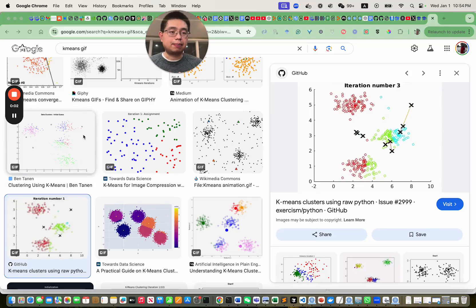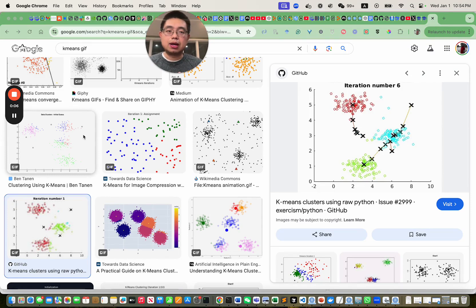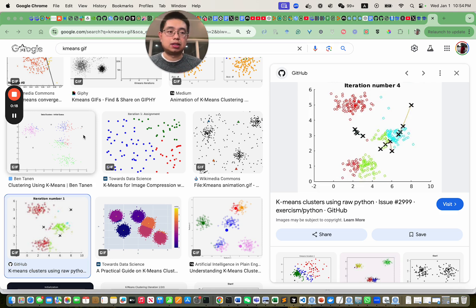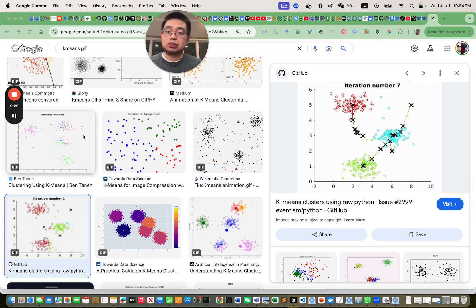Hello, this is Tommy. Welcome back to Chatomics. In today's video, I'm going to show you how to do k-means clustering step by step in R for a gene expression data set. I will also talk about several tips and tricks that you need to pay attention to when you do k-means clustering. So make sure you stick to the end.